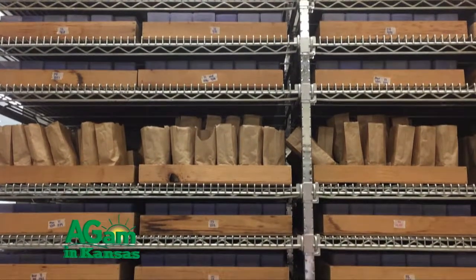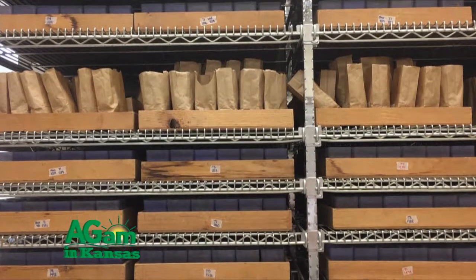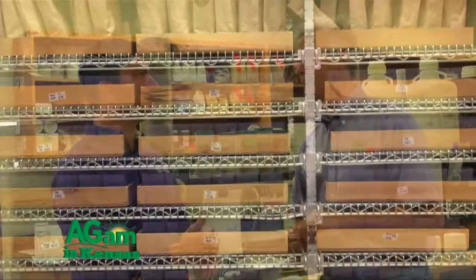That's right, and that's one of the main reasons why we do that, is because, again, we want to give some time to the customer to look at those results, make sure they don't have any additional questions, because if they do have more questions, like you say, we keep actually the sample here for about 3 months. So if they have any questions, they may want to look at other nutrients, for example, we can go back and retest and provide additional information on that same sample. That way the producer doesn't have to go back and collect samples from the field.